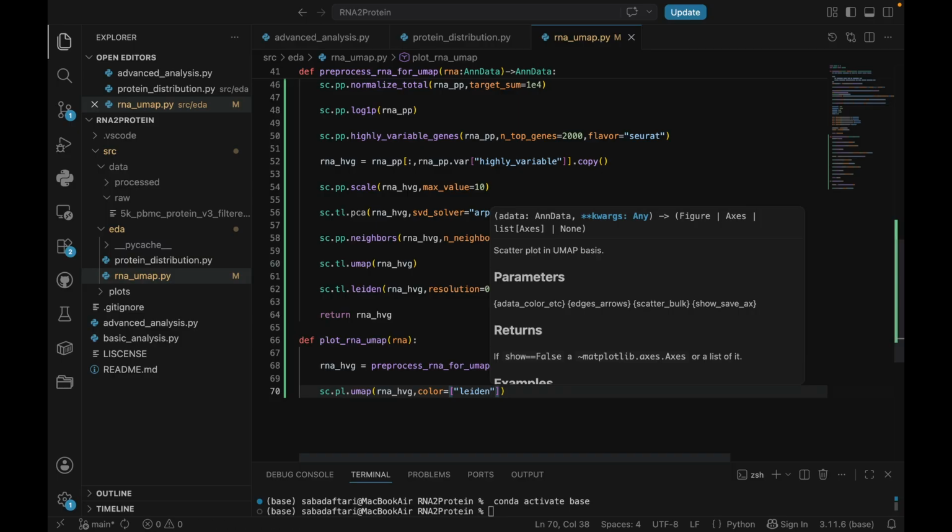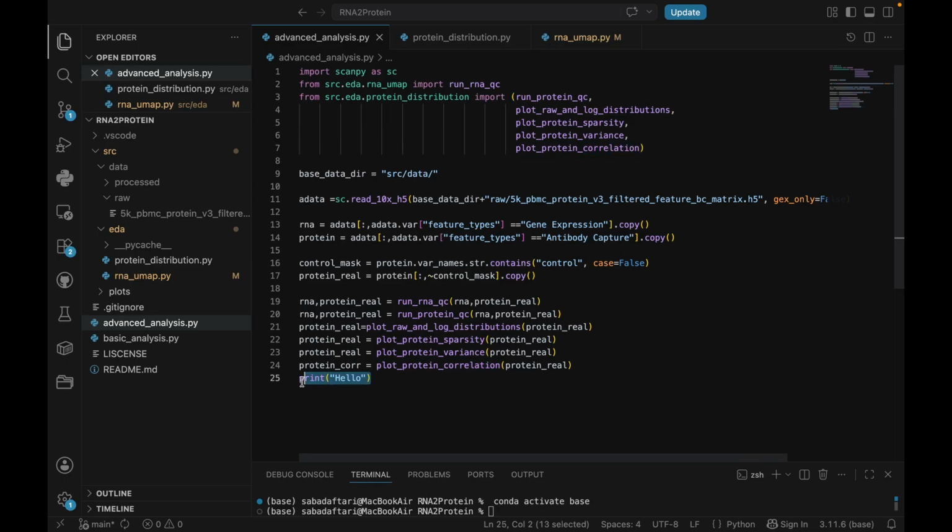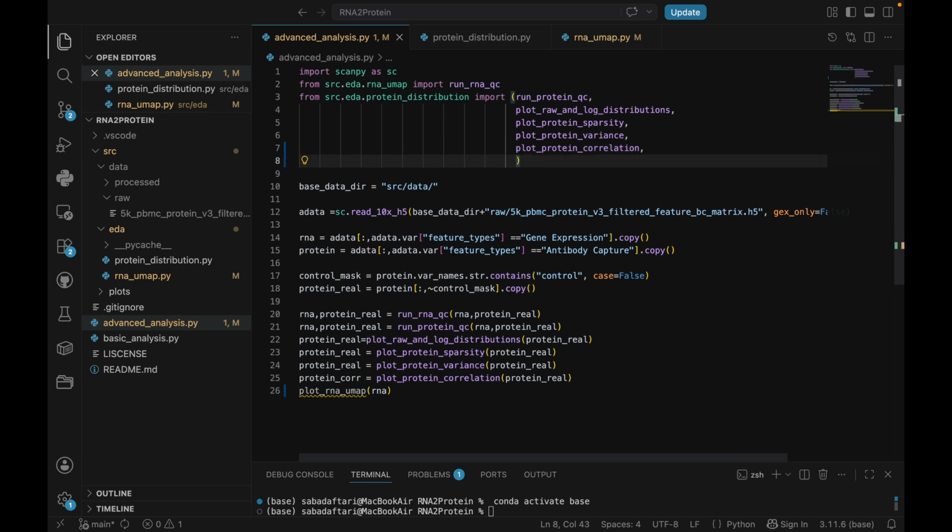each cell. So as I said before, Leiden is using neighbor graph to do the clustering versus using raw expression matrix. And for example, if we want to compare it with the k-means, in k-means we say I want exactly k clusters. K-means tries to force all cells into 5 groups. But Leiden is more like, I'm going to see how many I will find.